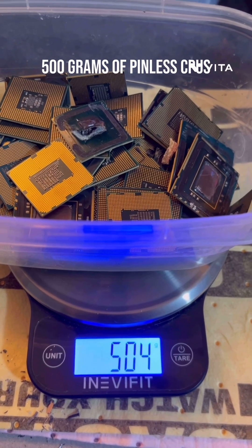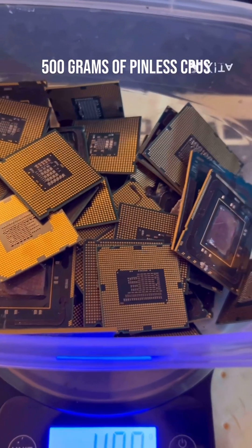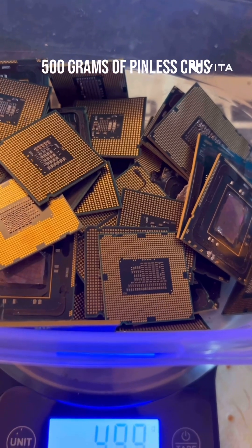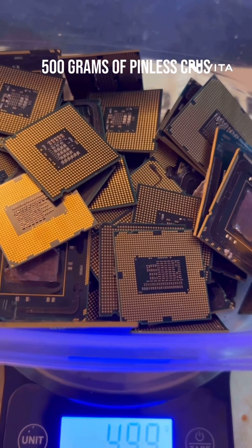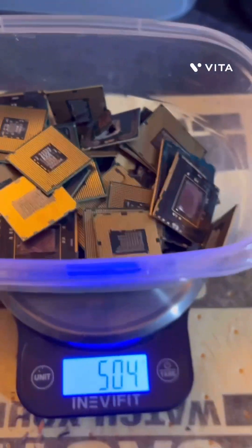So it's 504 grams of penless chips. They have the crystals on them, so I don't know what they have to do with that. I felt like running through AP to get the foils and then hydrochloric acid with some bleach. We'll see how that goes.